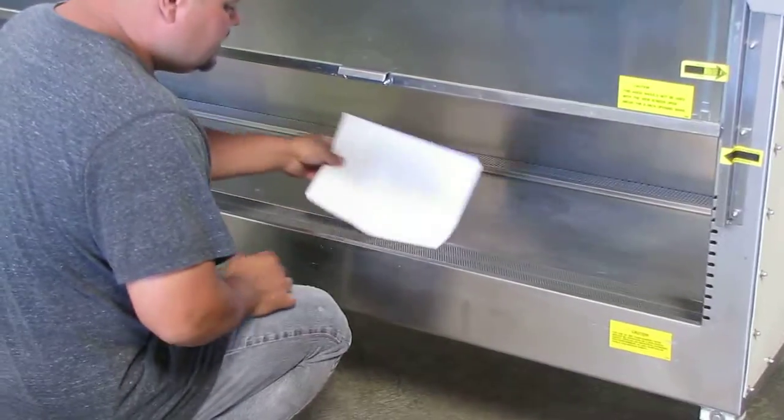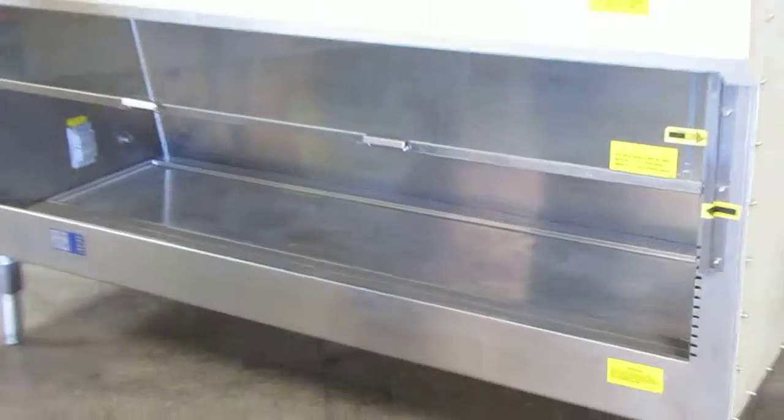So you see how it sucks in your paper? That's sucking in your fumes and it's going to direct them through your filters.